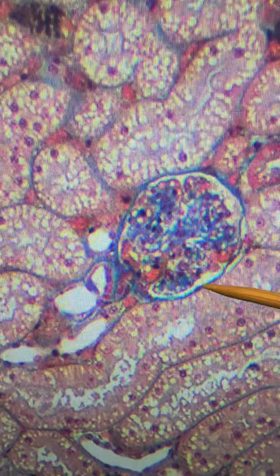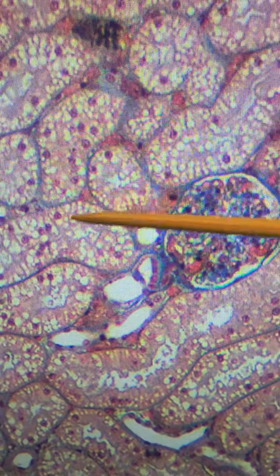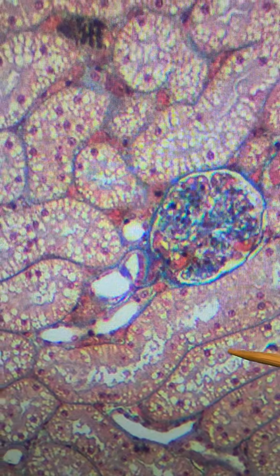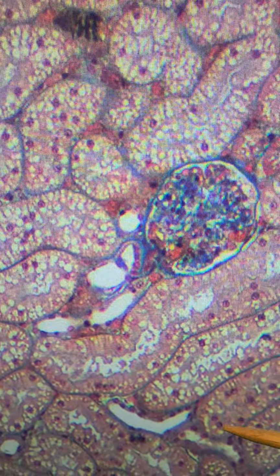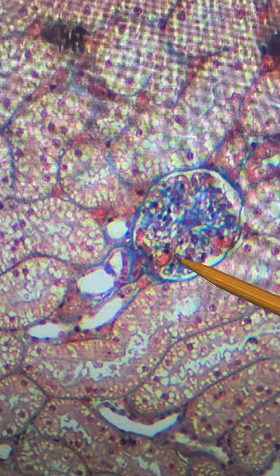Here we have a glomerulus. The glomerulus is made up of simple squamous epithelium. You can see all the proximal convoluted tubules. They have a very fuzzy appearance inside because they have microvilli on the apical surface.